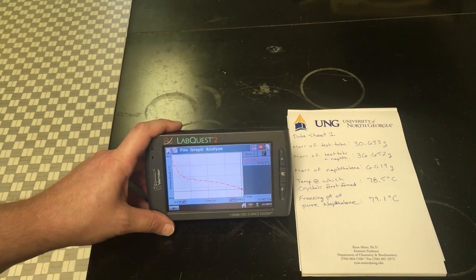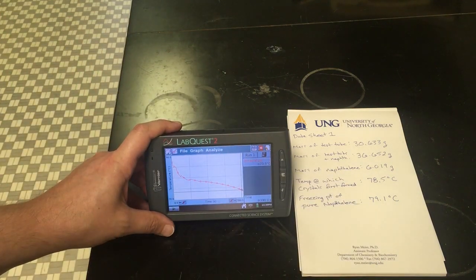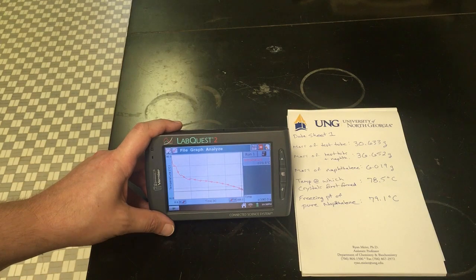And that's how I'm looking at this data. Now, for your actual post-lab work, on D2L, you're going to see an Excel file that will have all of this data from this trial in it. And you'll see the same for trials 2 and 3 as well. So you have the Excel data that you can use to make plots that CSE Pub will ask for.